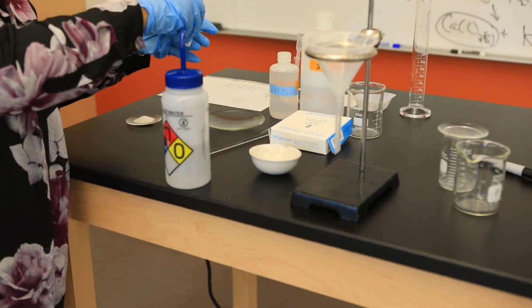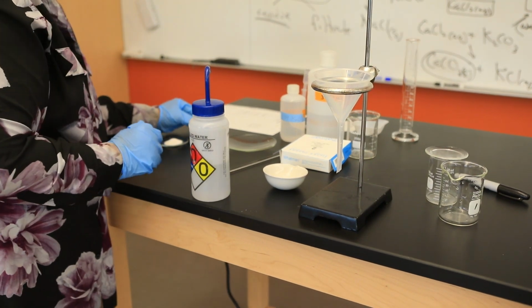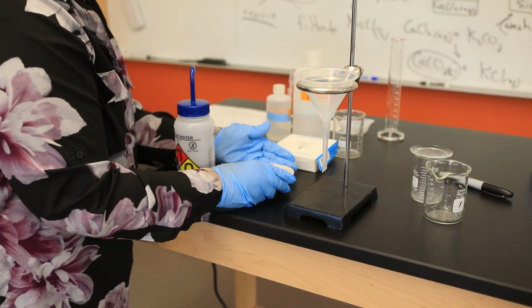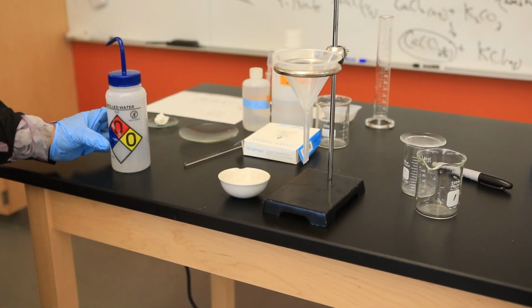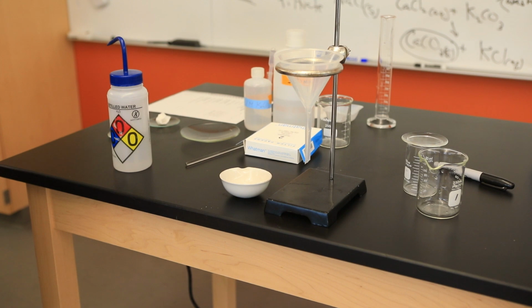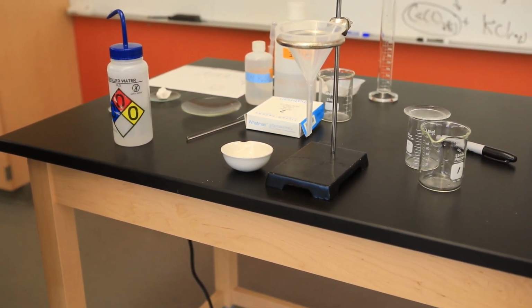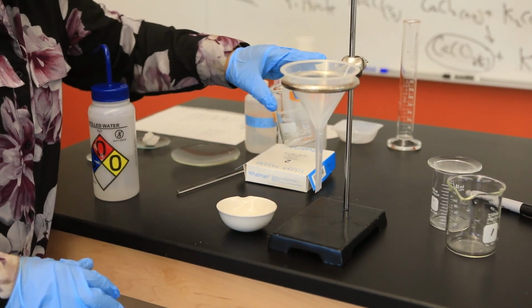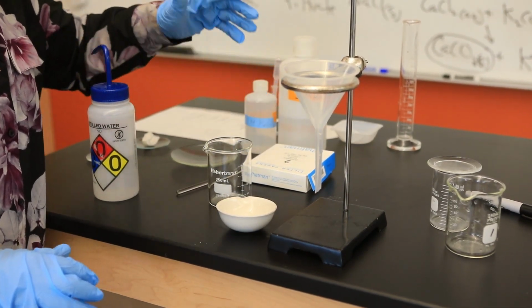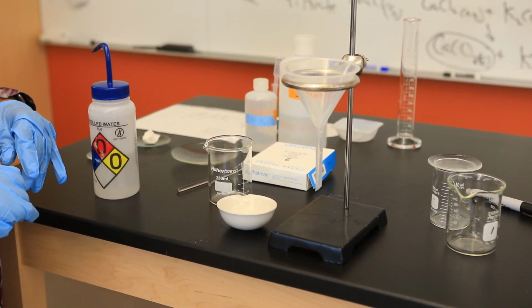I'm going to allow that solution to settle. What I'll do next is pour off. I'm going to try my best to pour off only the water, and the residue, calcium carbonate and sand, will then remain in my evaporating dish. I'm going to grab another container just to pour off that solution.